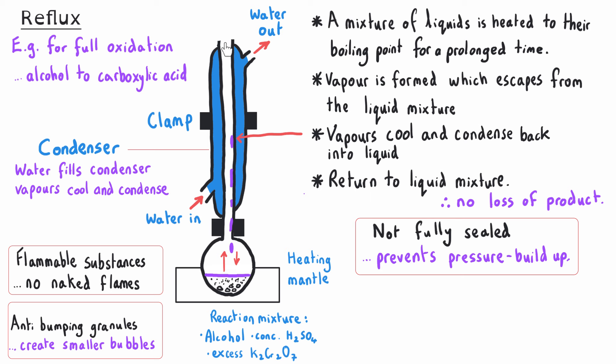We don't seal our condenser at the top, but it is really important that there are no gaps further down the apparatus, because if there were gaps, some of our vapors could escape. This could be dangerous and would certainly reduce our yield.